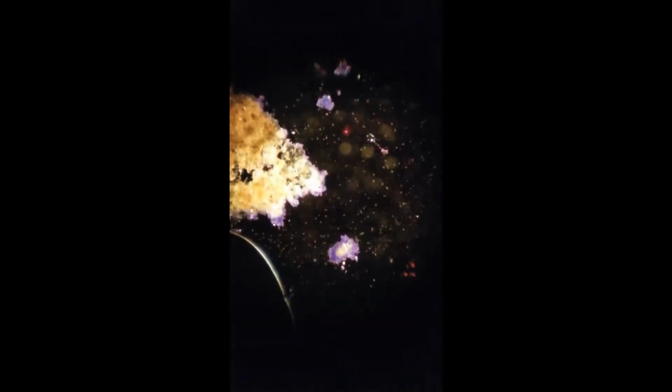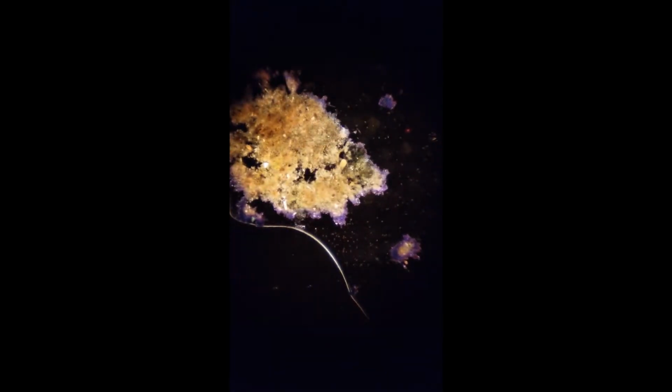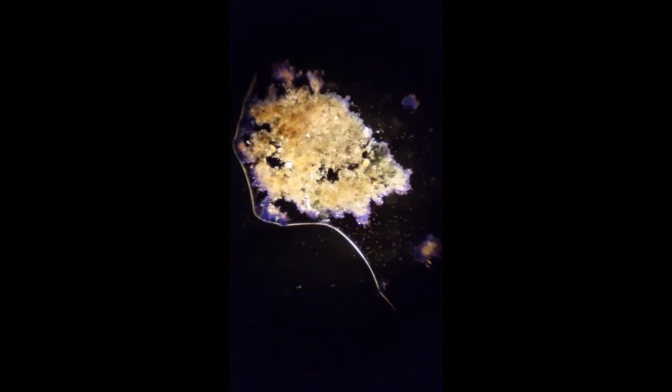Over here we see that the blue coloring penetrated some of the sides of this pond debris, but did not manage to stain the inside of it. Did not reach that far inside. And if I zoom in a little to some of the ciliates, let's see how they are affected.